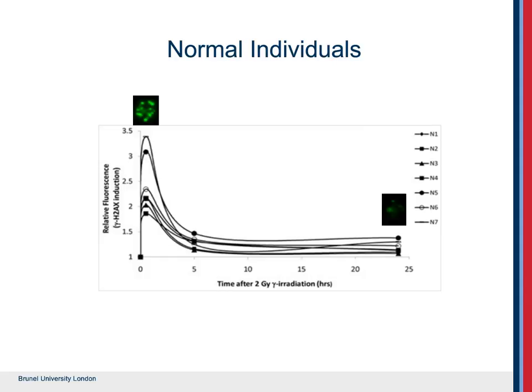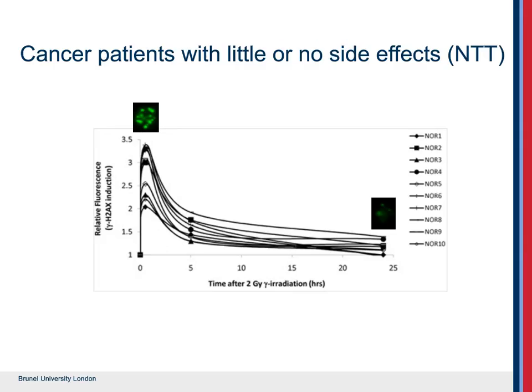Now this slide shows something similar, and it's from patients that had cancer, but had very, very little side effects. They did not experience much normal tissue toxicity. And again, you see the induction of damage, a slightly slower repair, but by the time you get to 24 hours, the cells have repaired the damage.